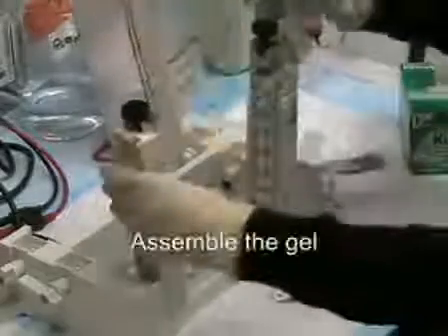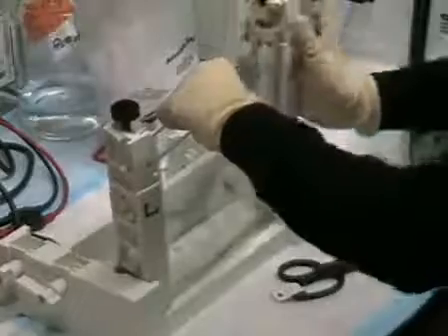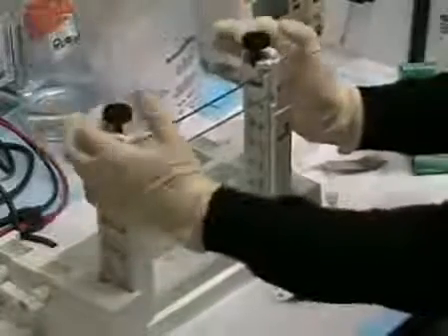So now I'm going to assemble the gel in these clamps. And then I squeeze them together and tighten by turning to the right.